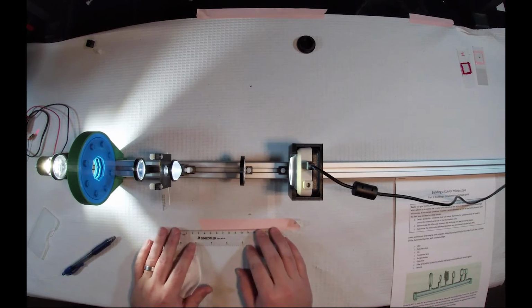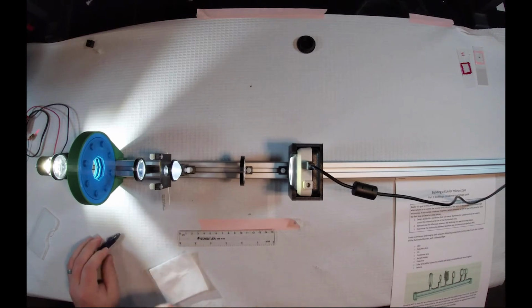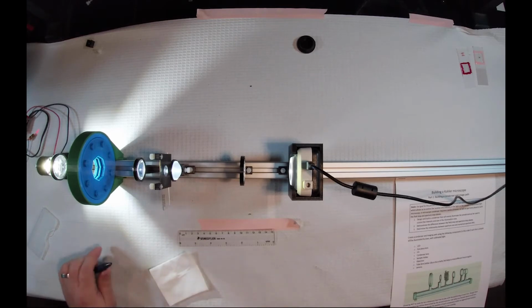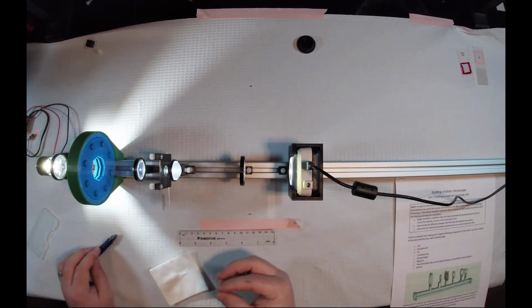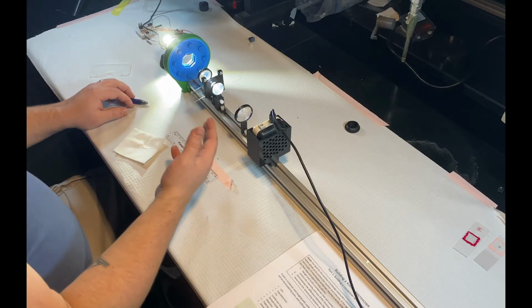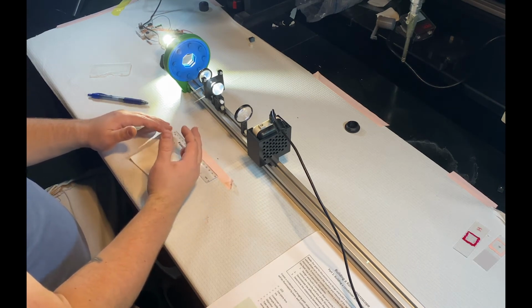What we're going to be doing now is messing with this iris that we worked with in the last lab. Now you'll remember in the last lab there were certain planes that I could put the iris in where it would change the illumination on the sample either by changing the area of the sample that was illuminated or simply changing the total illumination that the sample received.